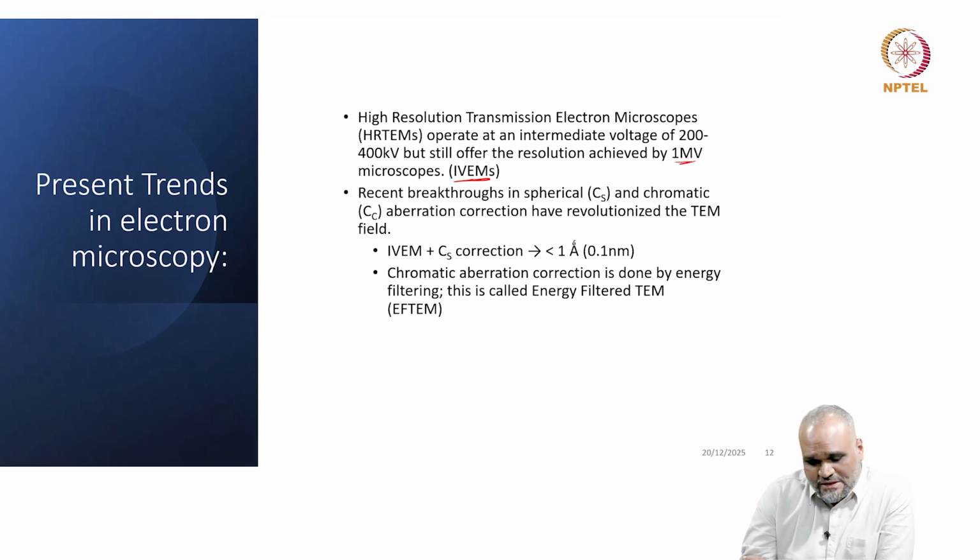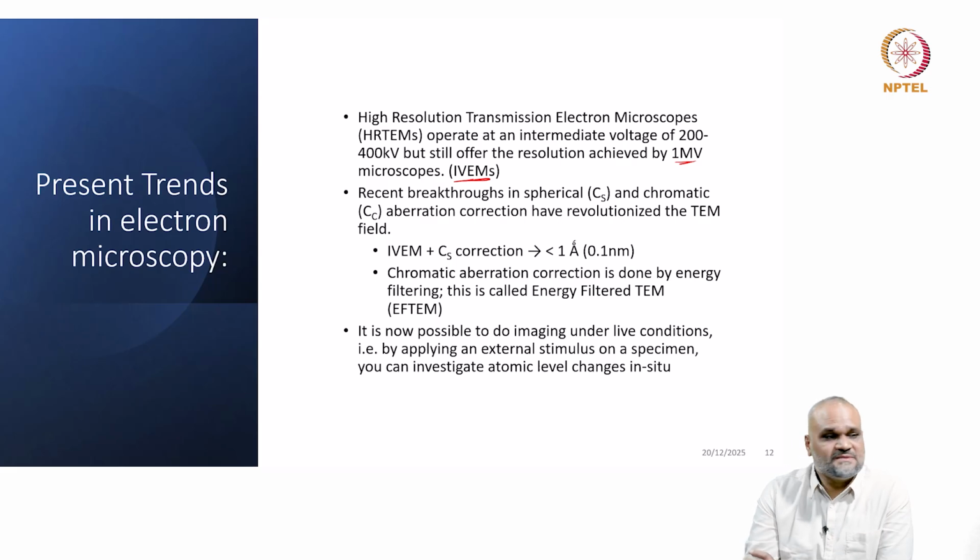So you get energy filtered TEM imaging, and you can get images with resolution of features less than 1 angstrom quite regularly these days. And it is now possible to image under live conditions as well. What exactly you are doing here is applying an external stimulus to a specimen, and you can investigate atomic level changes in situ.